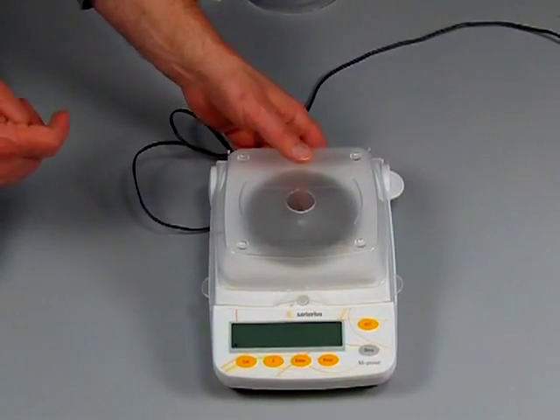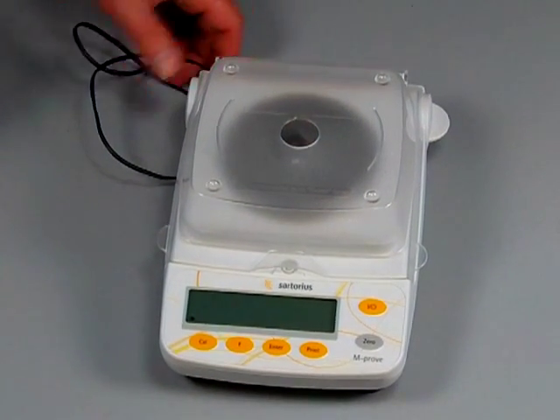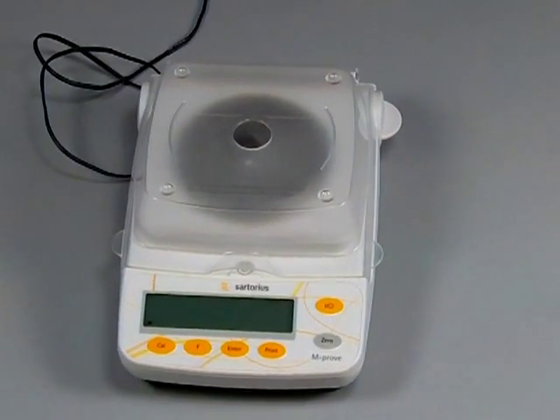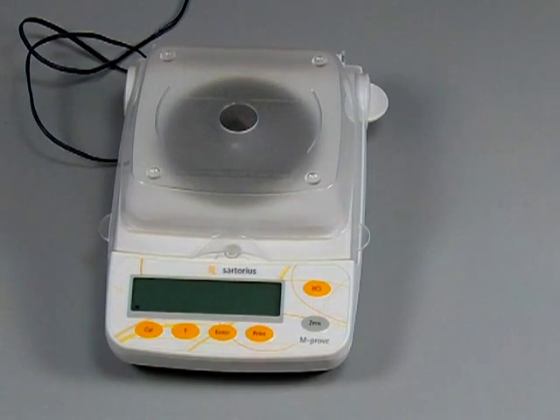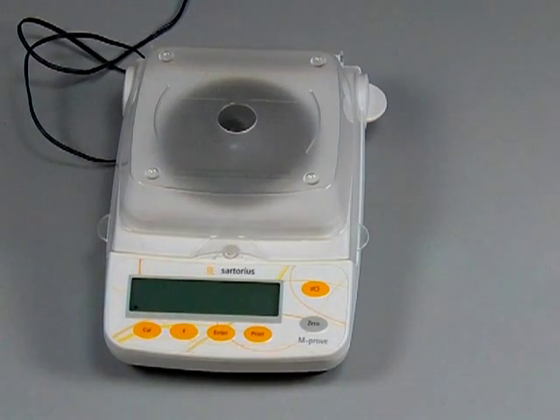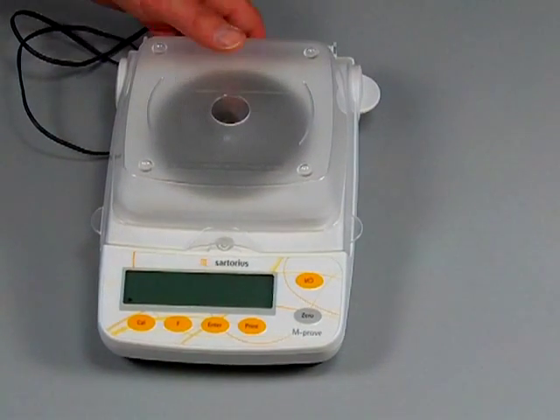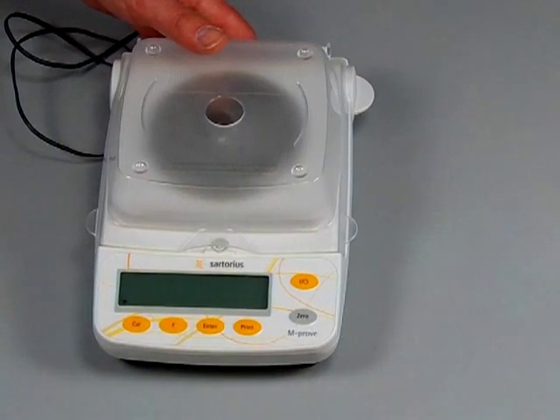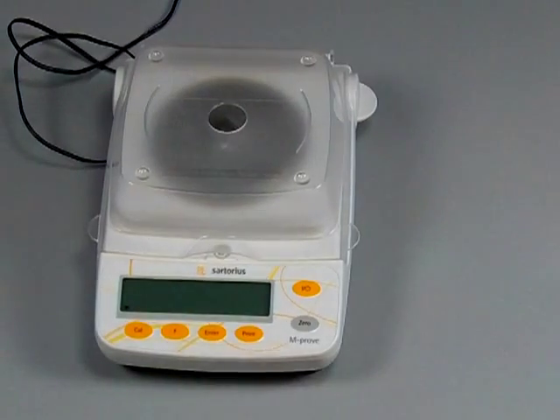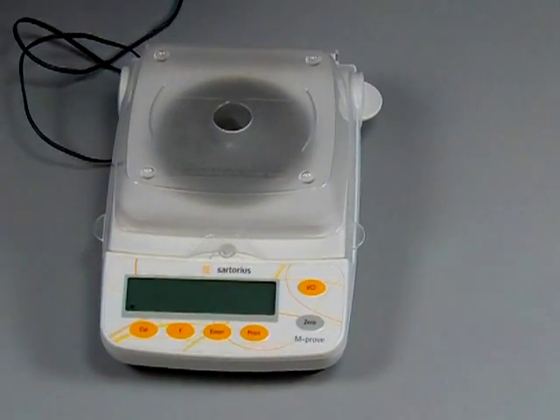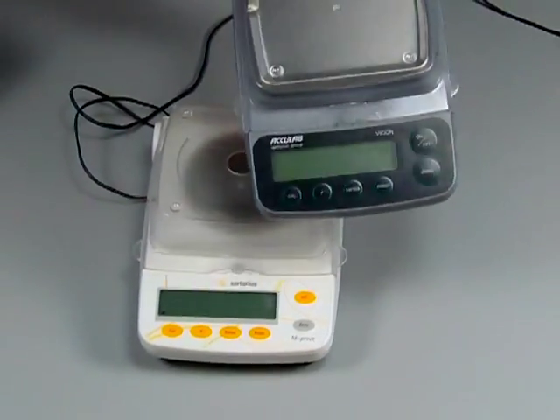So again, we just wanted to show you the new AY series from Sartorius. These are now pretty much in stock. It's like a five to seven day lead time for them. They are assembled presently in Nevada, Colorado. We don't know how long they'll keep on manufacturing them in Nevada, but presently Sartorius has a facility in Nevada, Colorado. So again, this is the AY series and we just wanted to show you the old series when they sold it under the AccuLab brand, very similar.